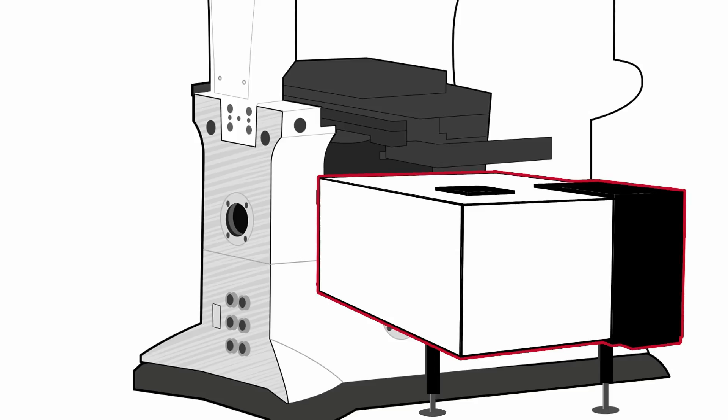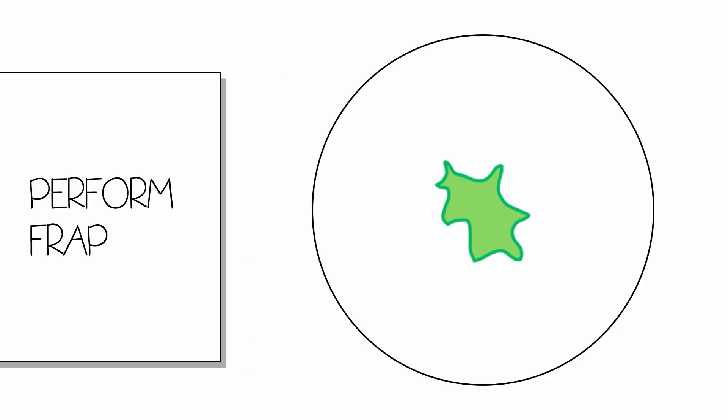Add the Infinity Scanner to the InfinityPort of the DMI8S microscope and enable a host of photomanipulation techniques.